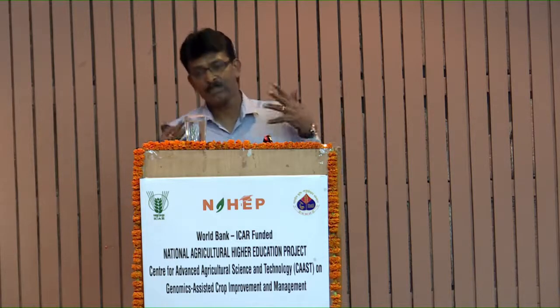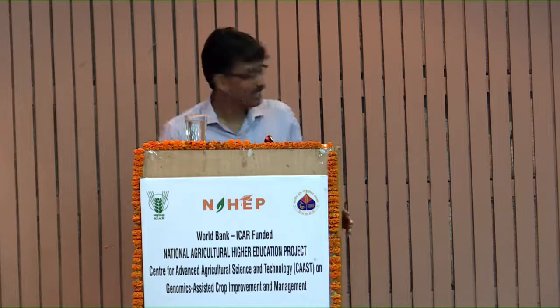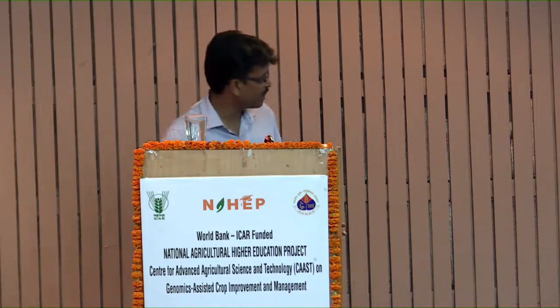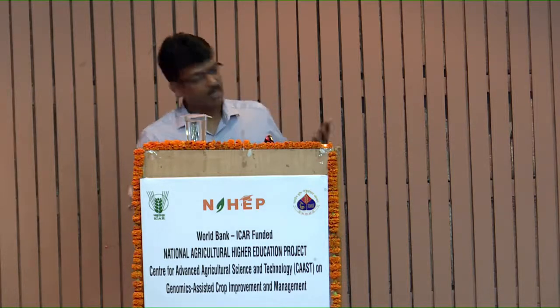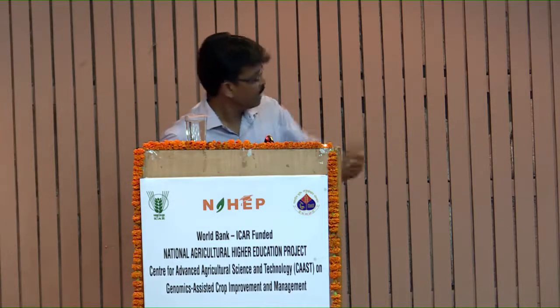Okay, please remove this confusion. Probes are made to order, and it is supplied by a company, right? And that you are going to keep in your lab. And remember, for every target you have to make this probe. It is expensive, and it is hard to sequence sometimes, and of course somebody is reporting false results also. But nevertheless, this is extremely specific for qPCR applications, right?